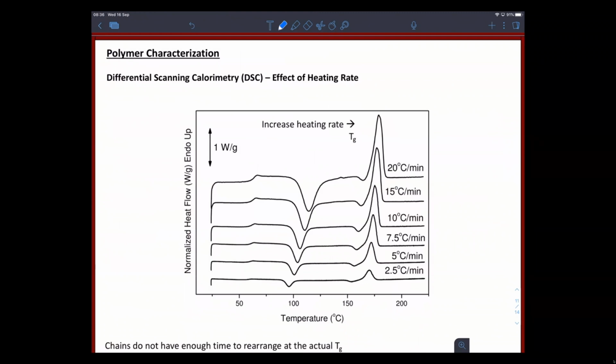So the computer part can change the ramping and the temperatures that we get up to. So what you can see here is, again, as we, where is it, this bit here? It's not immediately evident, but there is a slight shift to the right-hand side and a higher temperature. So what is that I've just outlined there? What is this transition?